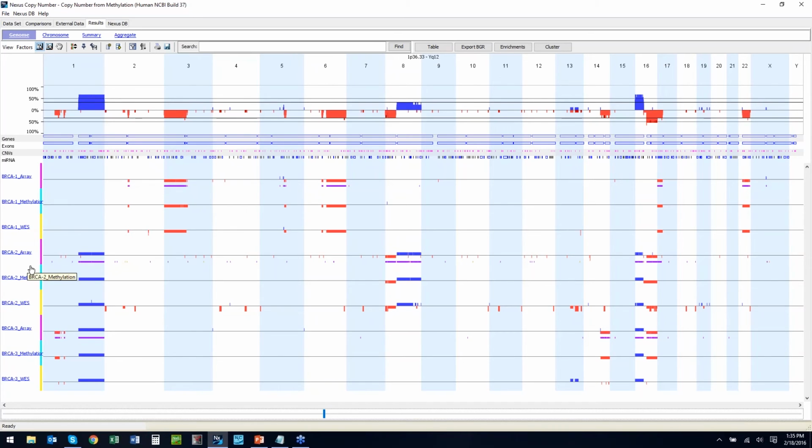You can mix and match. Just keep in mind that you do have differences in coverage, so you may not always detect very small, fine changes with each of these different methods. Now, in addition to extracting copy number information from these sources, we can also integrate our alternative data sources into our analysis using their traditional output.